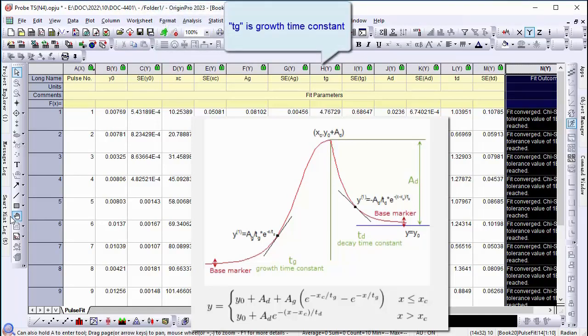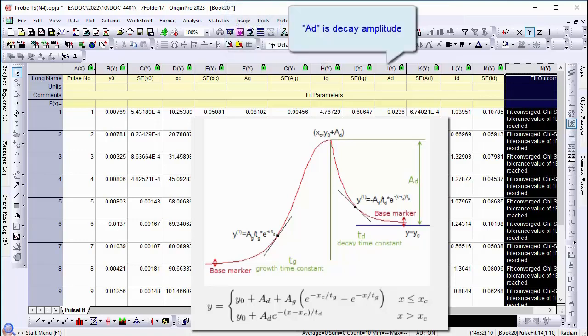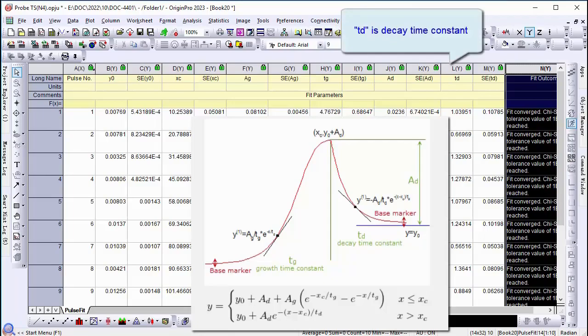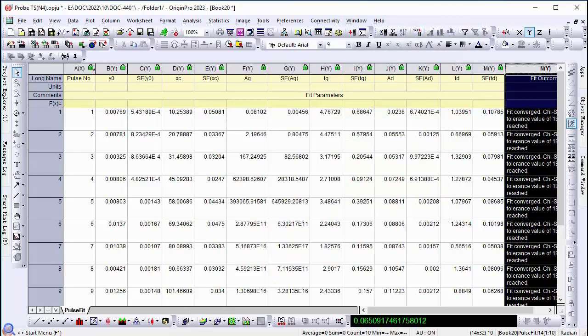tg is growth time constant, ad is decay amplitude, and td is decay time constant.